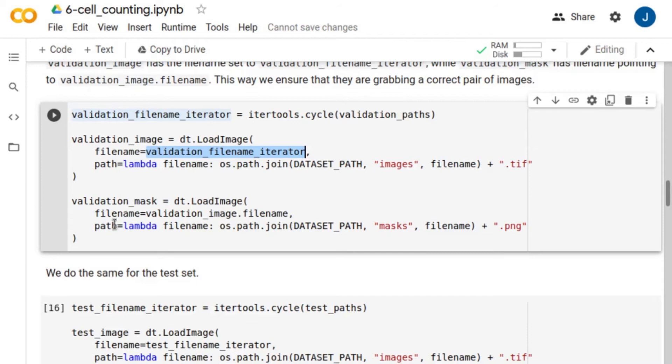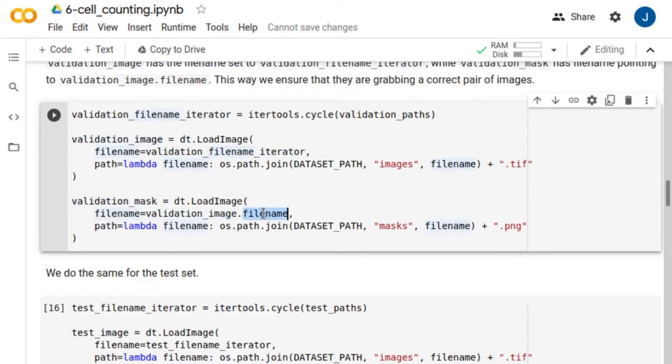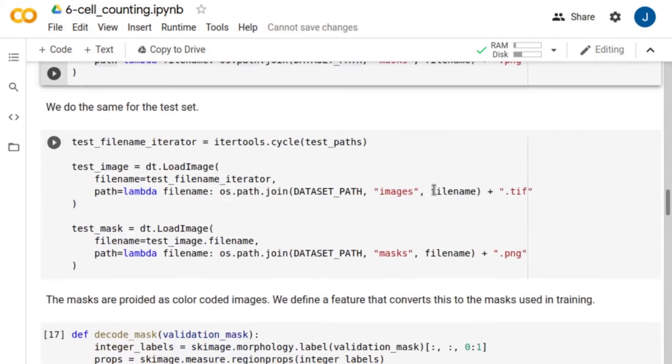However, for the mask, filename points to validationImage.filename. This way, we ensure that we are reading the correct pair of images. We do the same for the test set.